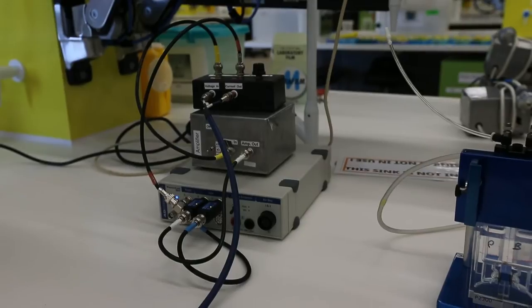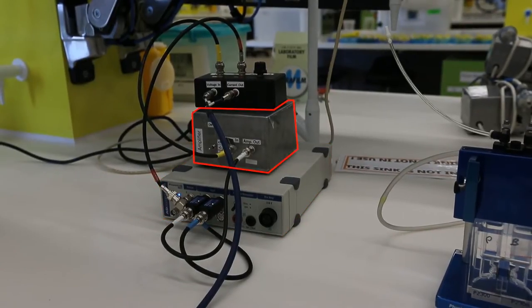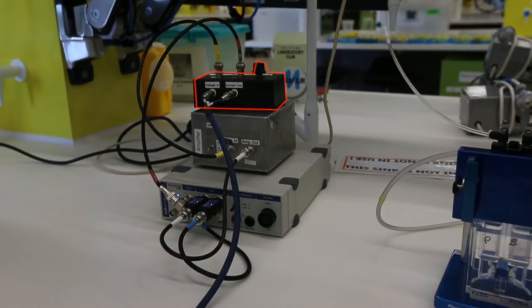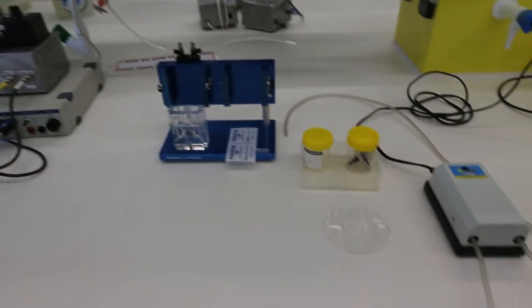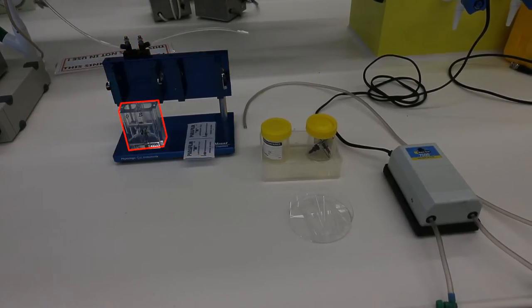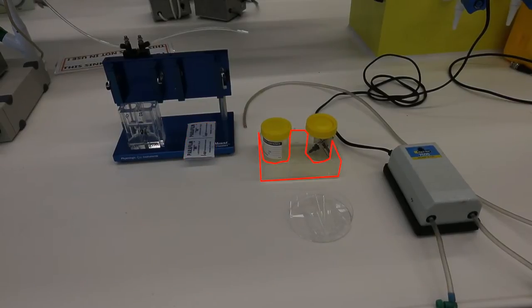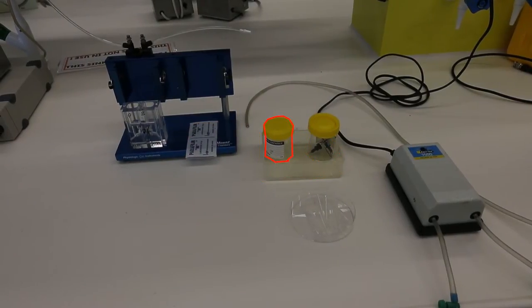On the bench in front of you, you will find a power lab, a silver amplifier box, and a black resistor box. You will also find a blue easy mount frame, a perspex Ussing chamber, a sheet of parafilm, a tray for catching waste buffer, a specimen jar with a blank tissue holder, a specimen jar with four electrodes, a petri dish with four agar bridges, and an air pump.